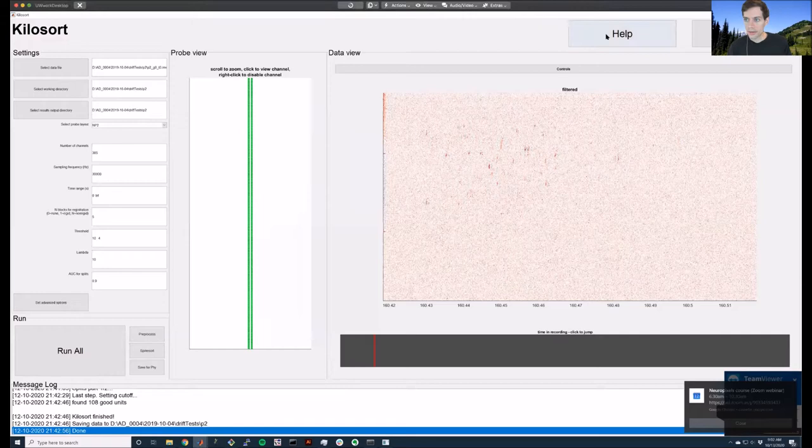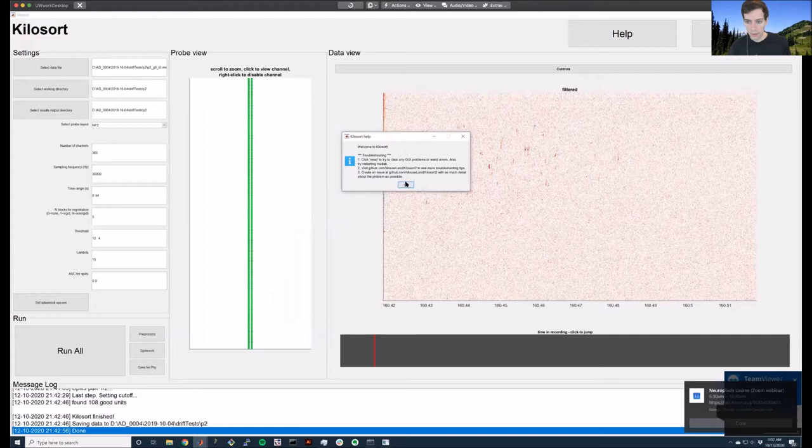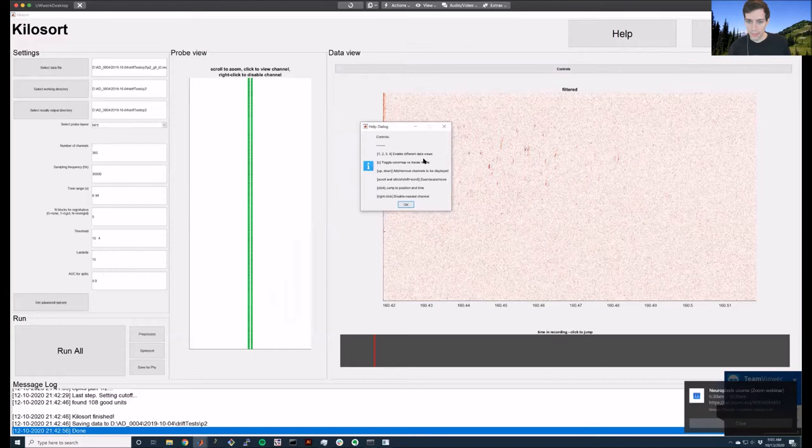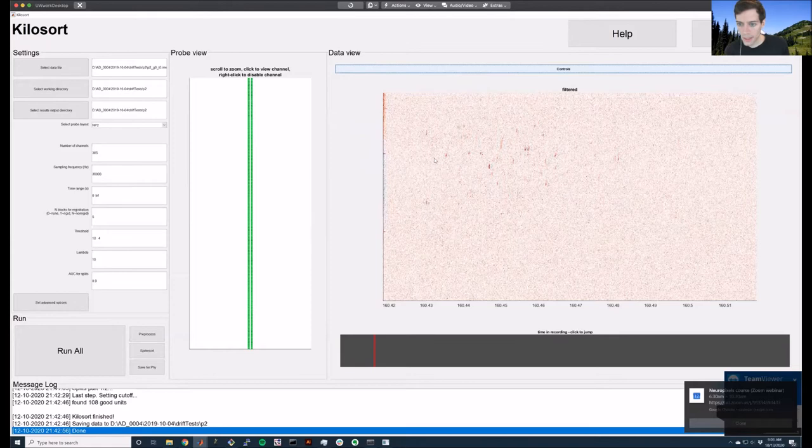What are the functions you need to know about here? First of all there's a help button which says welcome to Kilosort, here's some troubleshooting, and here's how to get help or create issues. There are also controls which bring up a dialogue listing the different controls available to you. In these views you can click on things to navigate.